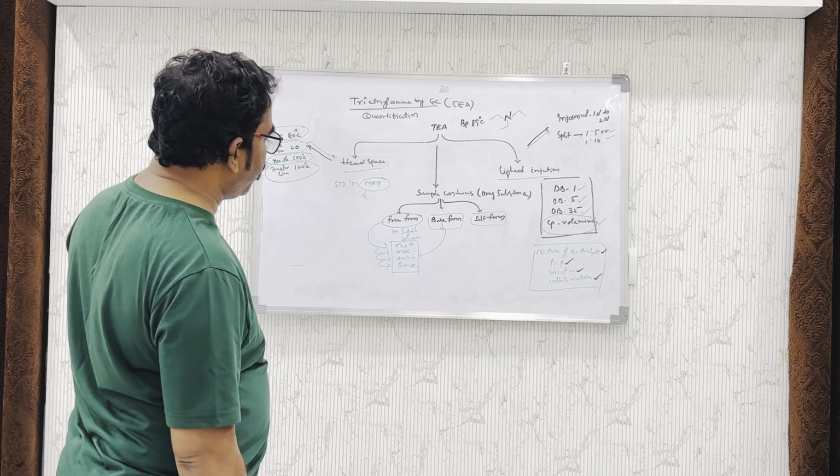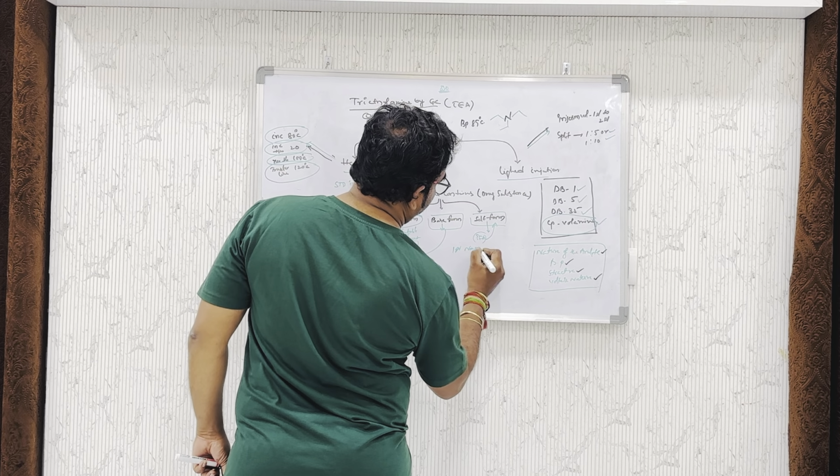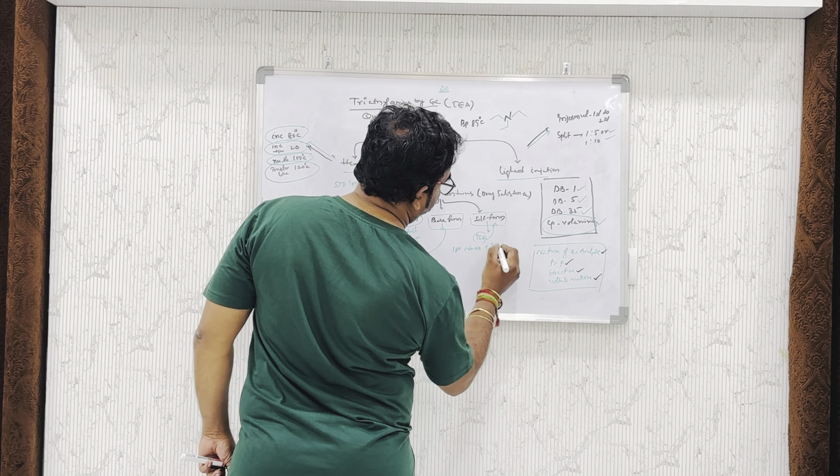Extraction technique means the sample we compulsorily need to dissolve in a base solution. For example, the base solution can be 1 normal NaOH solution.